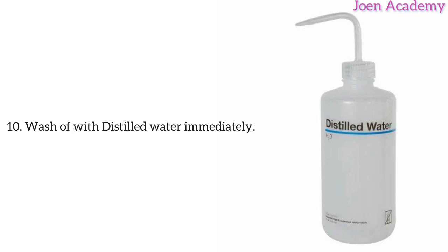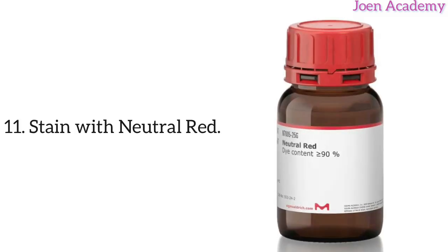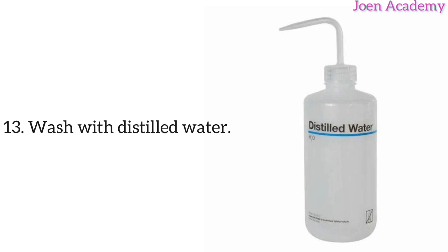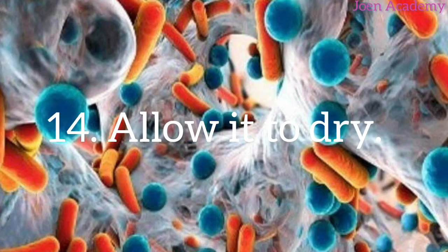Now stain it with neutral red. After staining it with neutral red, you allow it for a minute, after which you then wash it off with distilled water. After washing it off with distilled water, then allow it to dry.